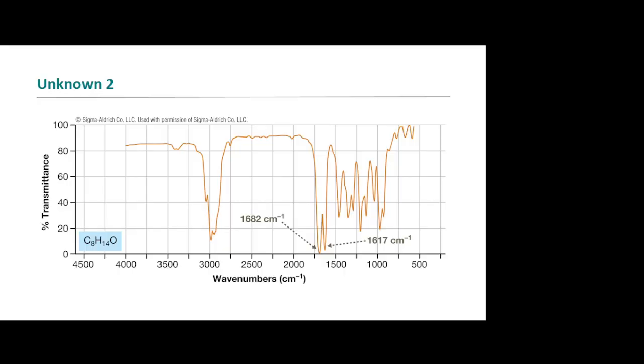Okay, so here we have an unknown, and you're going to tell me which functional groups that molecule would likely give me that spectra. So again, what are we looking for first? Where are we looking, on the upstream or downstream? Can you say smaller number? Upstream is the larger number. Downstream. Yeah, higher frequency. Okay.